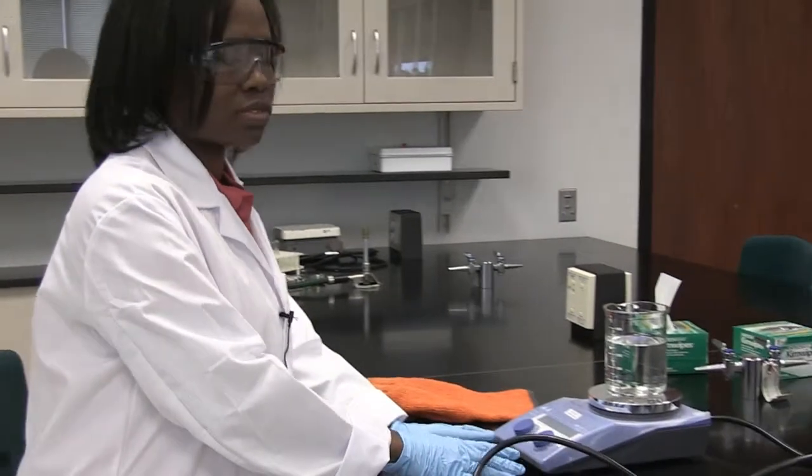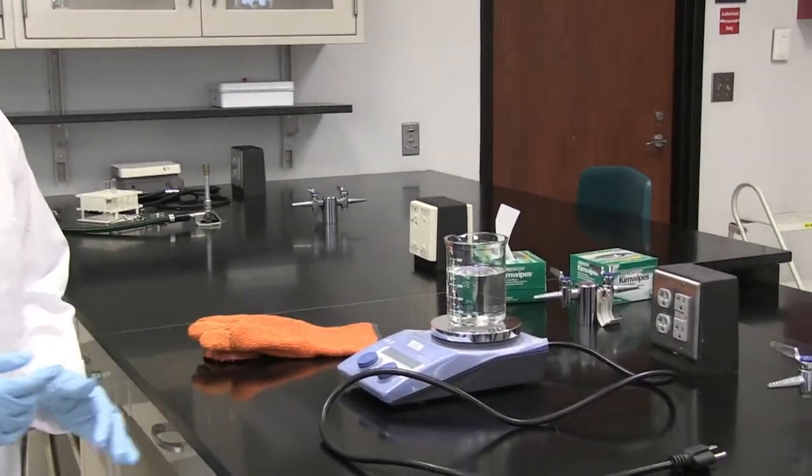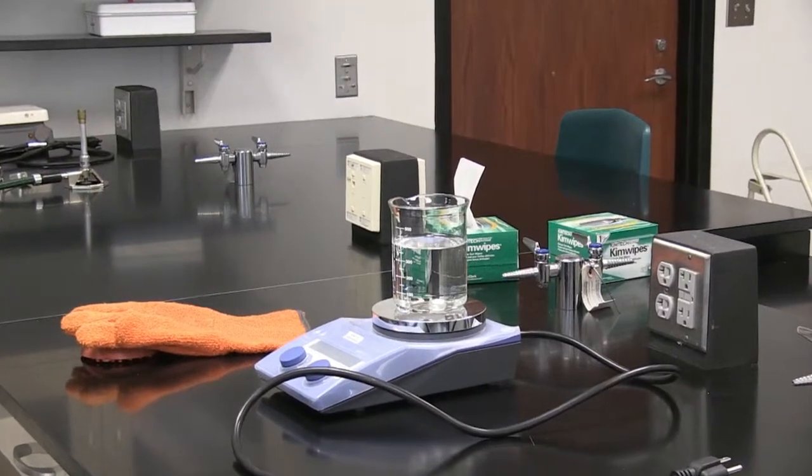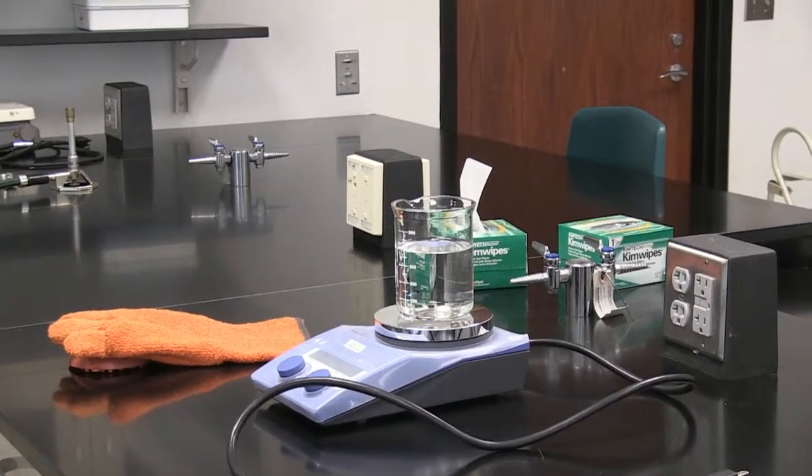Here are some rules to follow when handling electrical equipment. We're actually going to work with hot substances, so protect yourself with gloves and wear your eye gear.